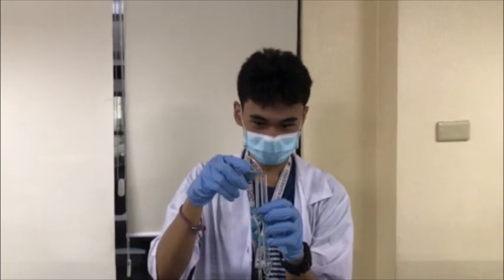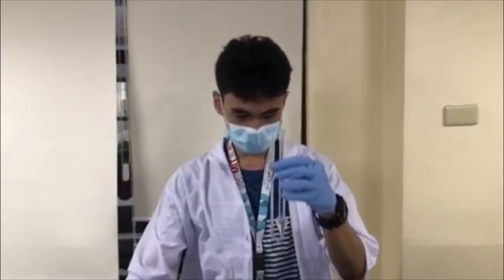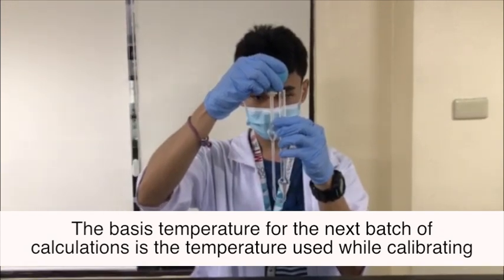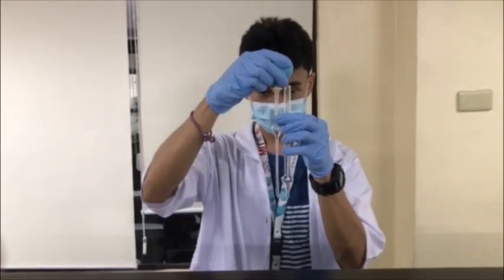To begin the calibration, the viscometer is filled with tap water until the sample has reached well above half of the fluid reservoir. We suggest using a reference temperature that falls under the 5 degrees Celsius increments. This will save the researchers from the effort of inaccurately interpolating known data, since most comparable literature values are often in these increments.